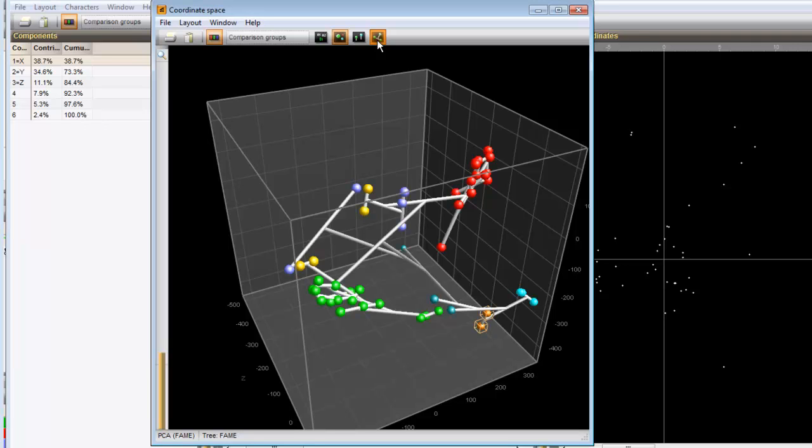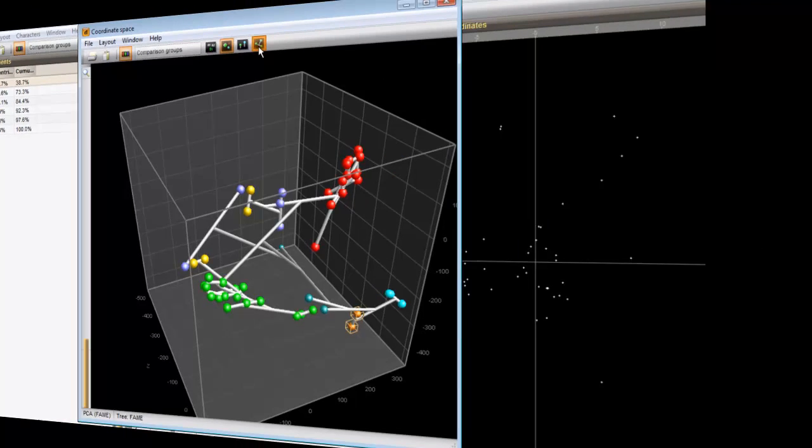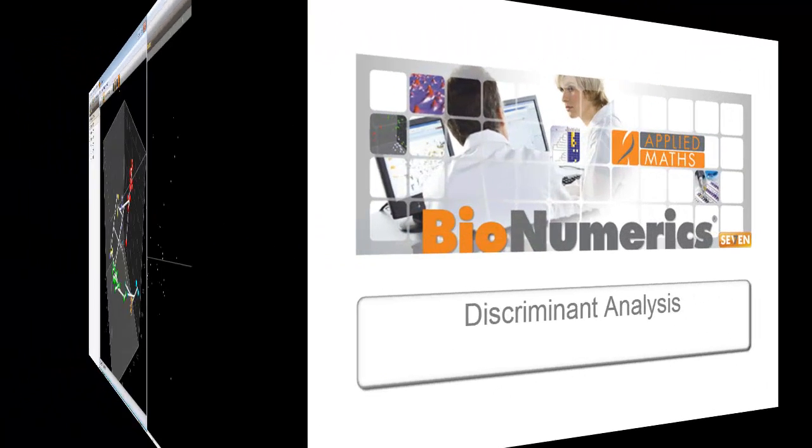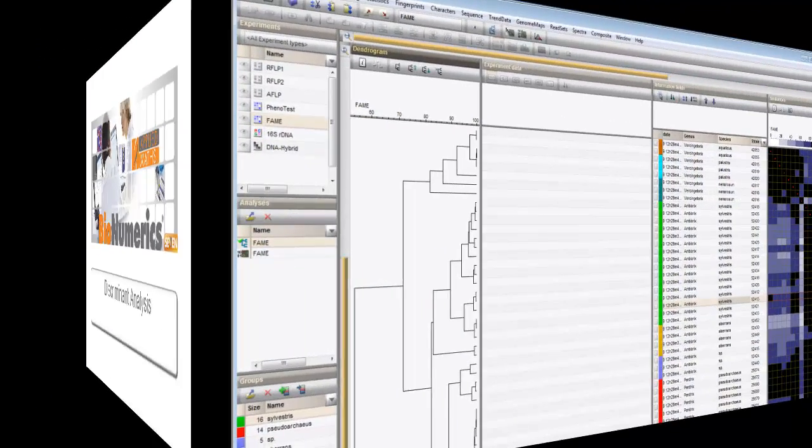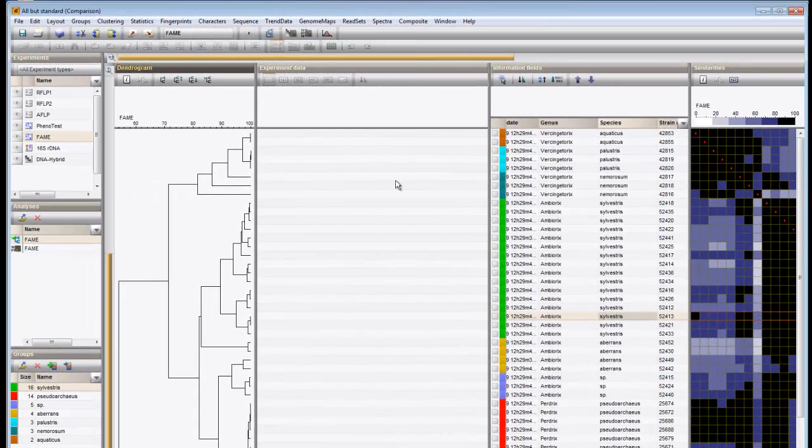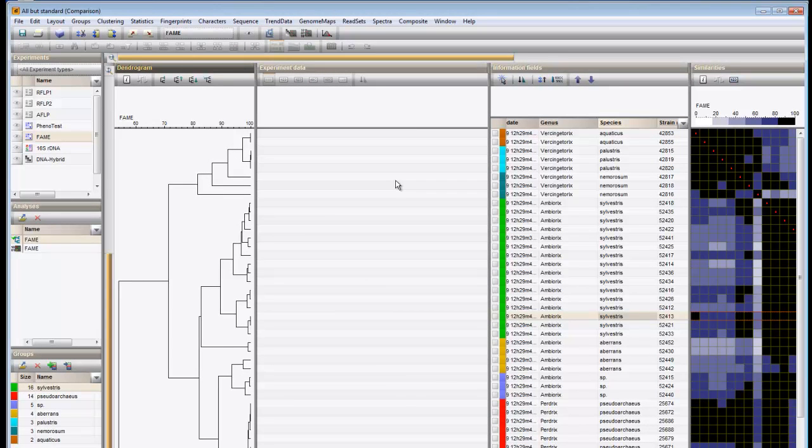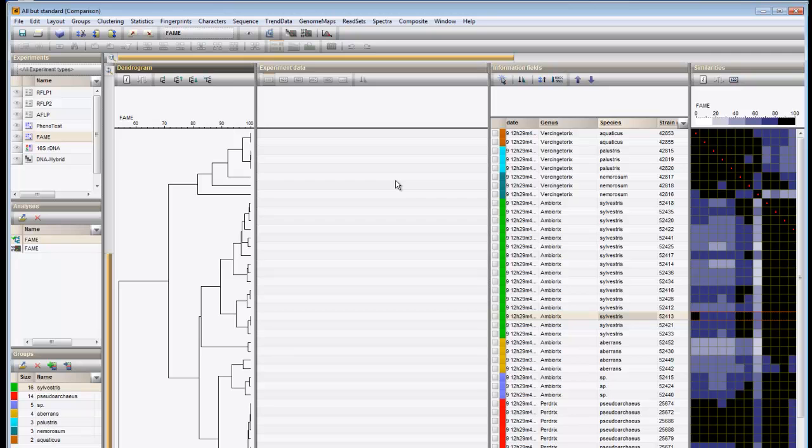Next, we will calculate a discriminant analysis. Discriminant analysis is very similar to PCA. The major difference is that PCA calculates the best discriminating components for the character table as a whole without foreknowledge about groups, whereas discriminant analysis calculates the best discriminating components for groups that are defined by the user. In case of discriminant analysis, these principal components are then called discriminants.